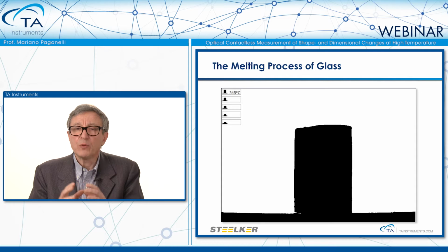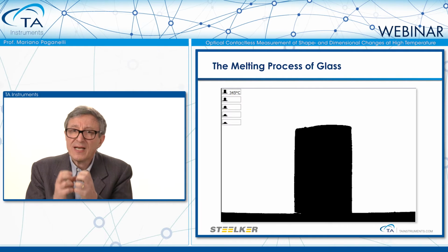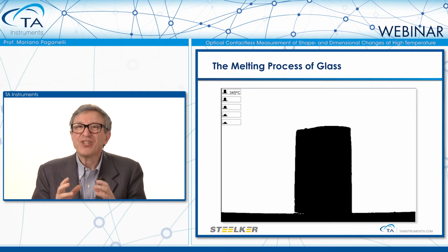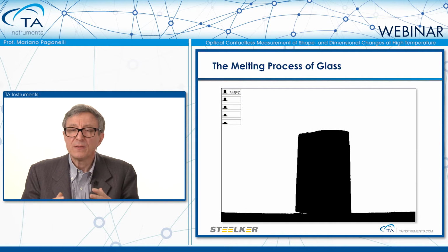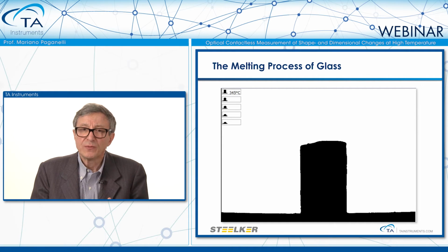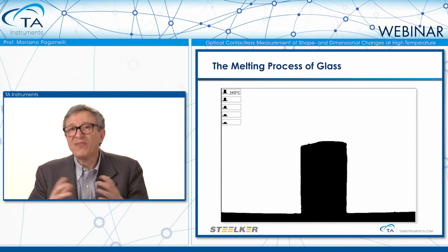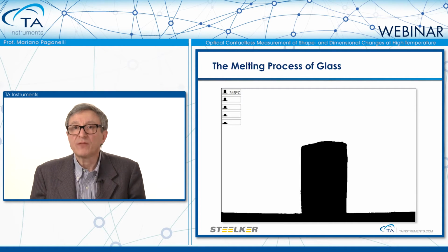The first detectable size change is the sintering beginning. Once the glassy phase develops inside the material, it starts pulling together all the particles, and the shape changes size but not shape. At a certain point, the liquid glassy phase emerges on the surface of the specimen, wetting the surface. At this point, the surface tension of the liquid phase exploits its strength and starts modifying the shape of the material. This is the point that we identify as the softening point.